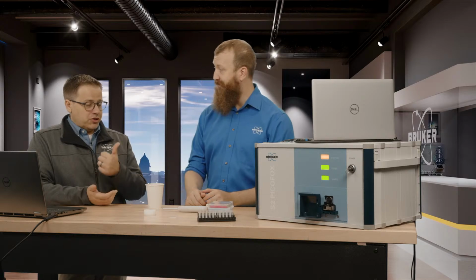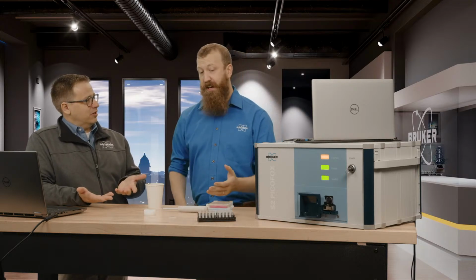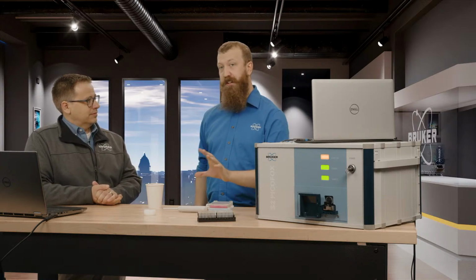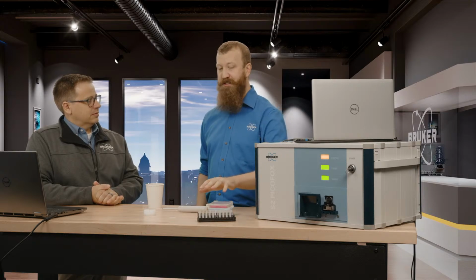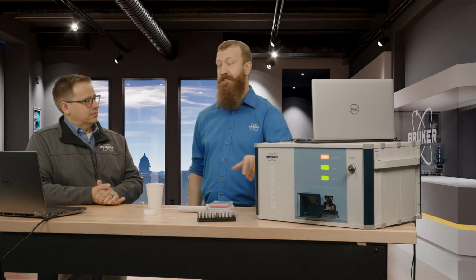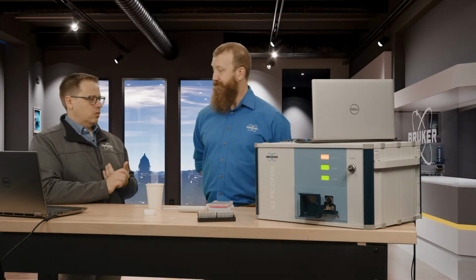Okay, so as long as you don't scratch it and you can get off whatever you put on, because this thing is so sensitive that parts per billion affect it. Yeah, that is one of the more critical parts of using this machine, getting your sample materials clean again. One of the more important parts of the cleaning process is once I've got a set of discs that I've washed, I run the blank discs in the machine to prove that I've cleaned them properly, because it's very easy to contaminate something.